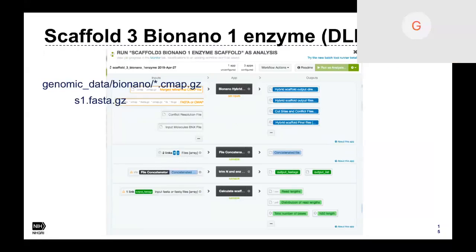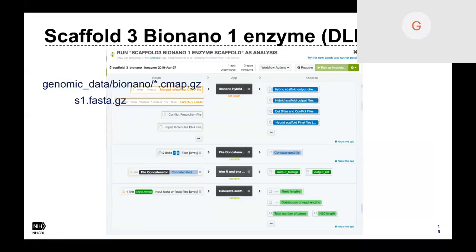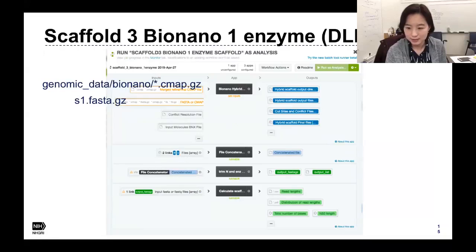I see. So it's not really a bug to some extent. I mean, it's somehow telling you the length of the DNA fragment. Could be, but by design, the NCBI version is getting rid of those. Yeah, I see. So I think it was a bug that the Bionano software had. Okay. Right. Any more questions?